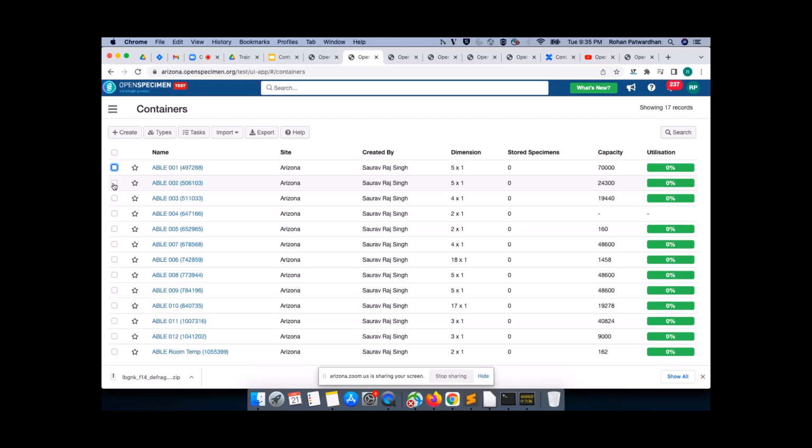So there might be a couple of cases like that. One might be that we have a pickup box that is sent out weekly on a particular day. Another type of thing would be defrosting a freezer. Those are two examples of regular things. Okay, so that can be managed.